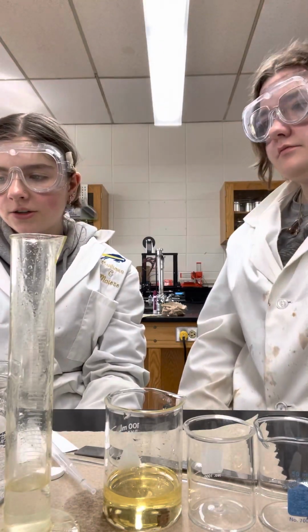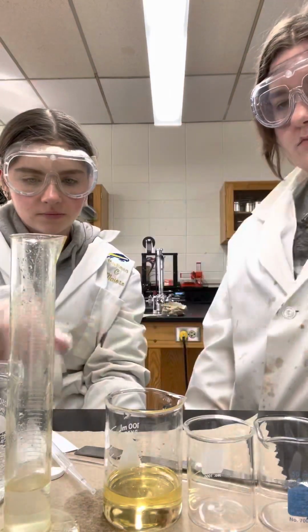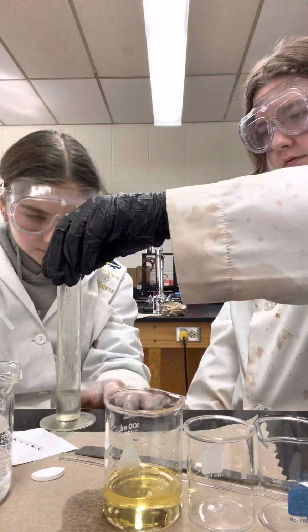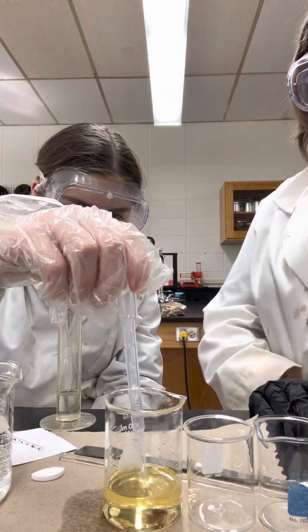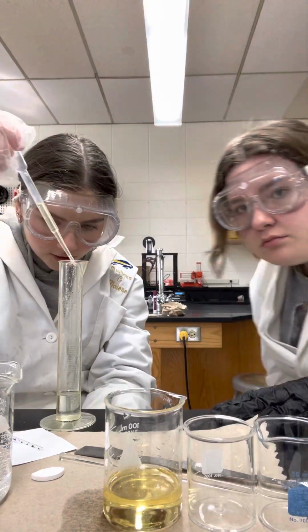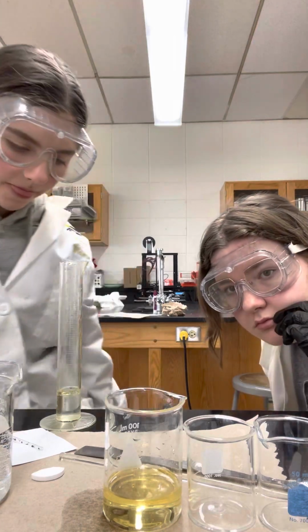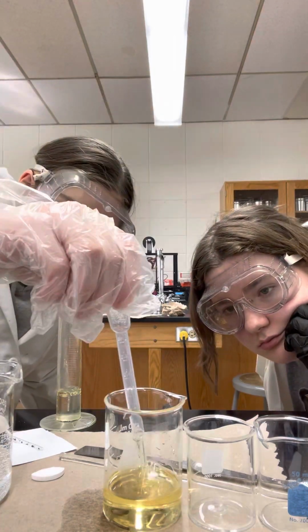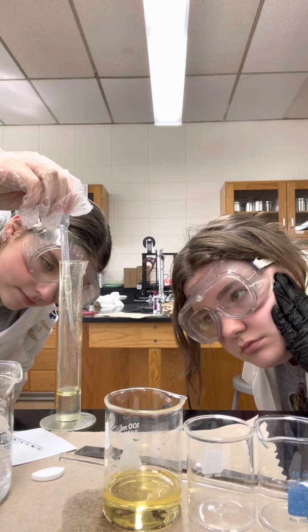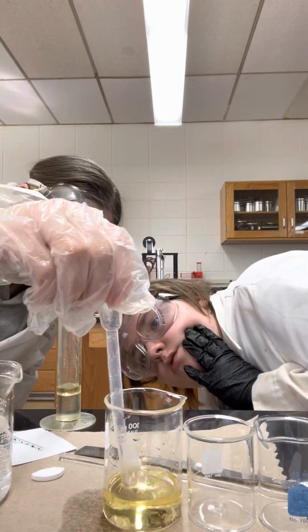Perform. With the water still in the graduated cylinder, add 20 milliliters of oil. Yeah. So I'll go up to 30, right? Yeah.